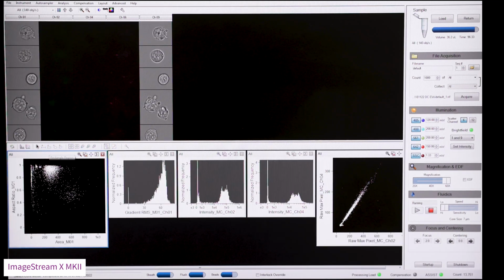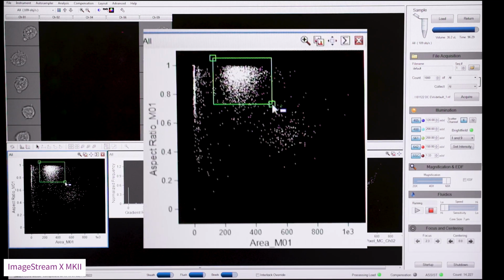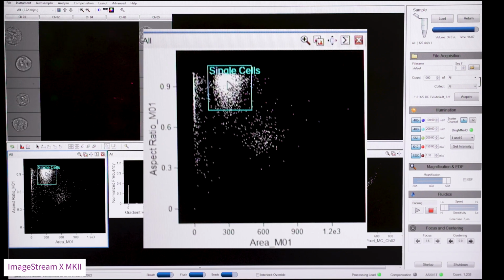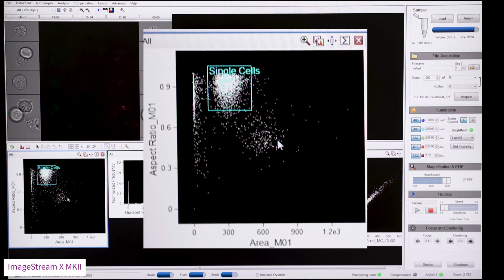Next, we will select our cells of interest, and to do this, I will create a rectangle region and draw around the single cells. Single cells have the highest aspect ratio and an area greater than the smear of debris and speed beads, which are apparent on the left of the plot. The other population, with low aspect ratio and high area, are aggregates of cells.